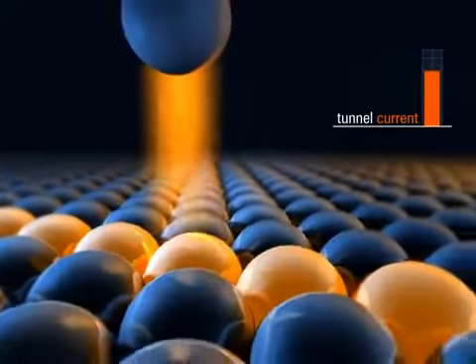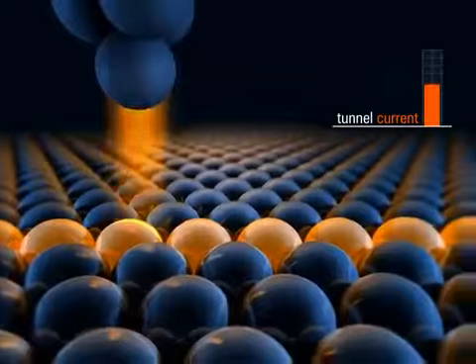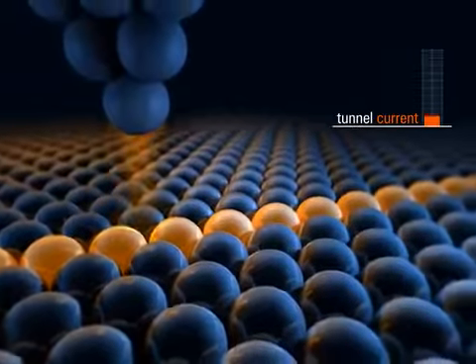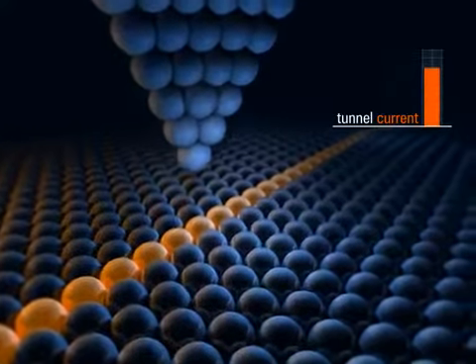If the scanning tip encounters a step on the surface, the tunnel current increases due to the smaller distance between tip and sample. A sequence of line scans provides an image of the topography of the sample.